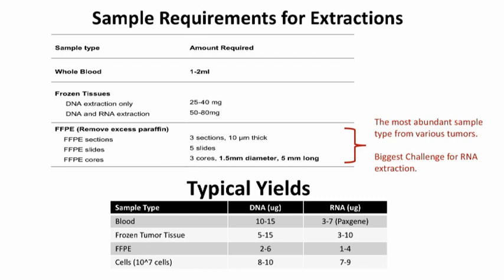Importantly, remember the earlier comments about the handling. The time from sectioning to processing, et cetera, is actually quite important and clearly will influence some of these things.